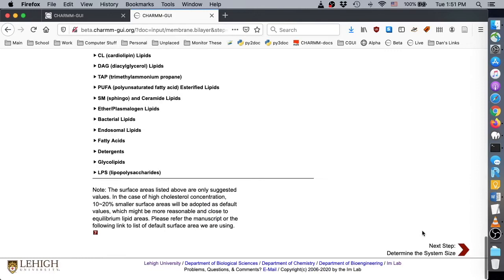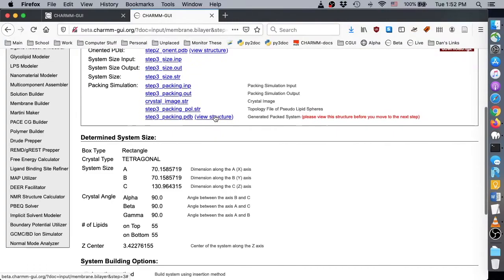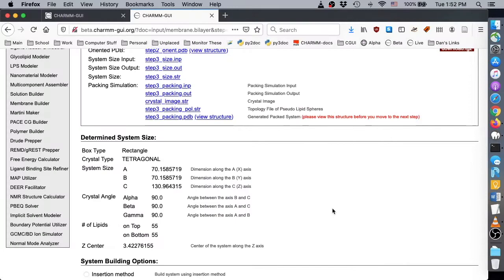On this page, we should view the oriented GPCR and the protein lipid packing model. We can change the ion concentration on this page, but for our purpose, the default values are acceptable, so we continue by clicking Next.